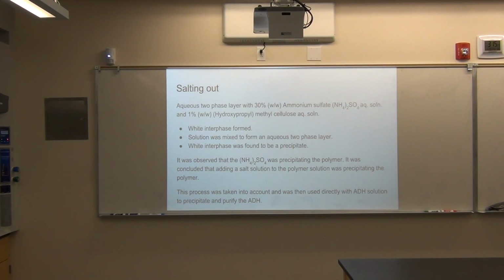Jensen, real quick, on your absorption measurements with your tea, did you do backgrounds on the other compounds to make sure that you weren't getting readings from something interfering? Yes, ma'am. And from that data and from the data I got from my samples, that's how I knew how to roll that out. Okay, so you checked all of the raw tea and bags and stuff? Yes, ma'am.